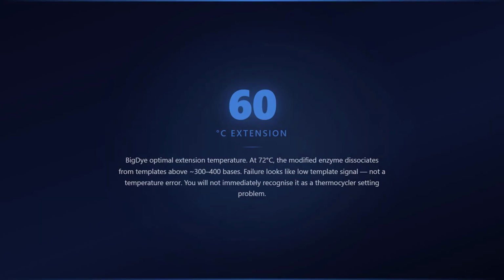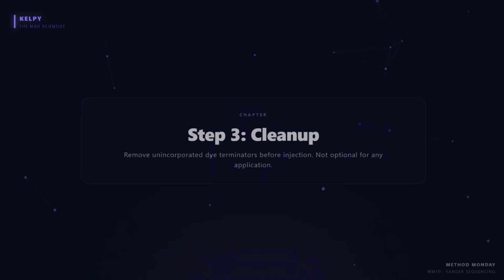This failure is not catastrophic. The read does not disappear. It degrades gradually past a threshold, mimicking low template signal rather than a temperature error. You will not immediately recognize it as a thermocycler setting problem.